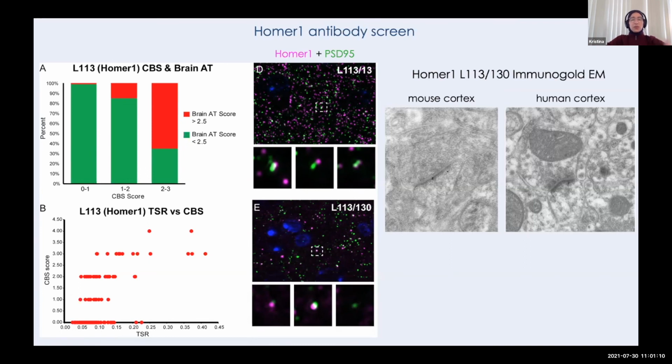So this gives us a really nice predictive screen that can be used during screening of a large number of antibodies, because I forgot if I mentioned, but we didn't find any correlation between the other applications and the performance of the antibody with array tomography on post-embedding. So even if it's immunohistochemistry on brain sections, which is pretty close, it still has no correlation with the performance of the antibody in post-embedding conditions.